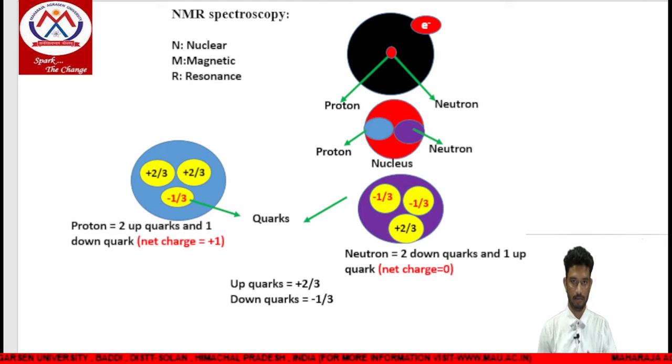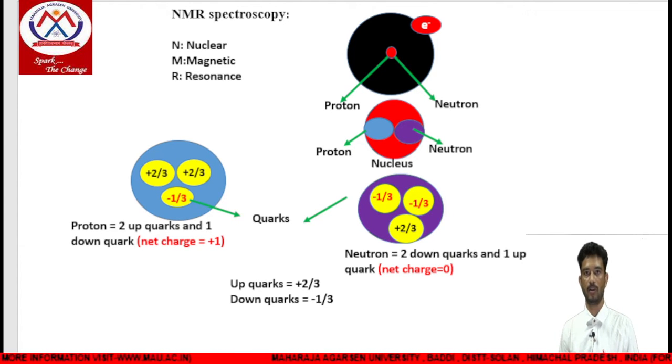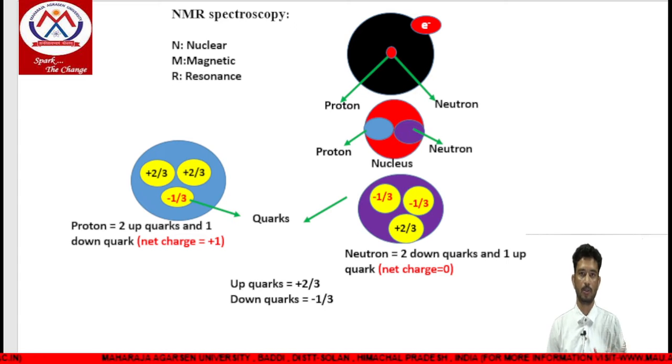So here we can see on the screen in the background the atoms, the electrons in the atom, and the nucleus. The nucleus is shown in spherical shape in red color. When we zoom in on our nucleus, we can see two particles, protons and neutrons.